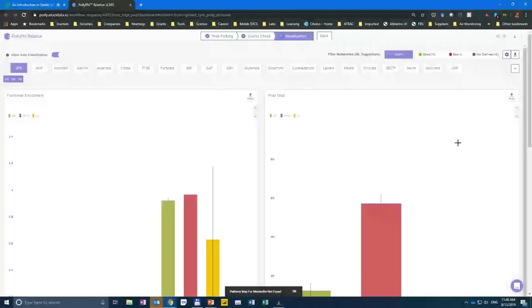Once the visualization has been created, we have another window in Poly. And as you can see, I'll start from the top and just explain everything, just to show you what this output is and how we can take advantage of it and what we can do with it.